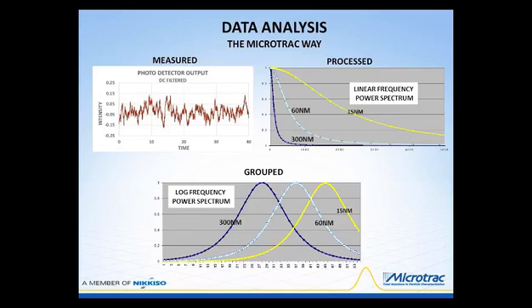We get the noise signal by doing a DC filtering of the base intensity, and we're left with the noise signal. Now that noise signal has a content in it that represents the velocity distribution of the particles. And it's from that distribution that we extract the particle size.